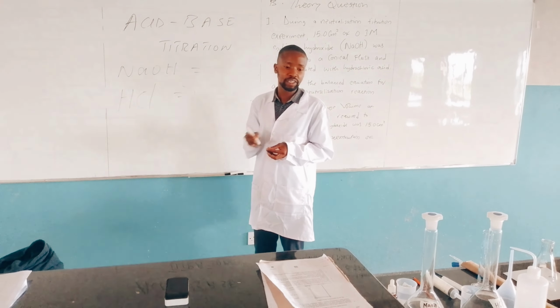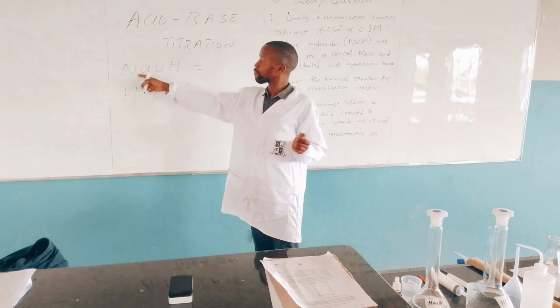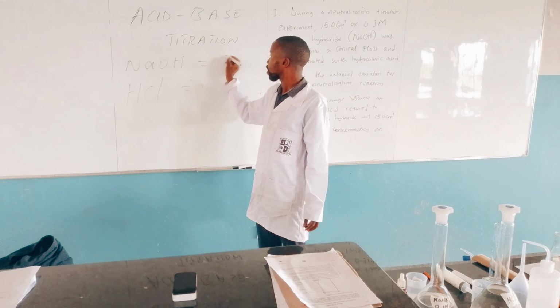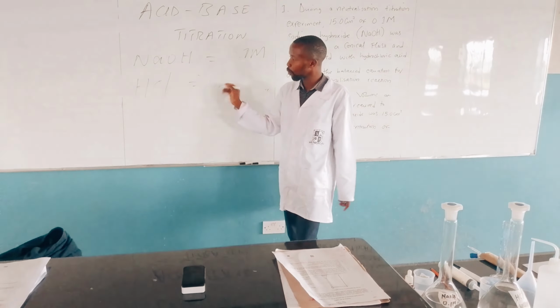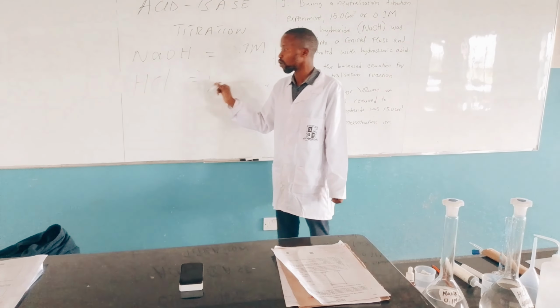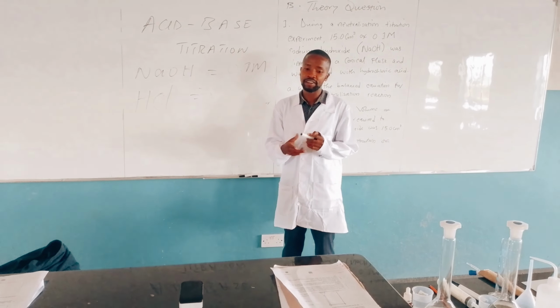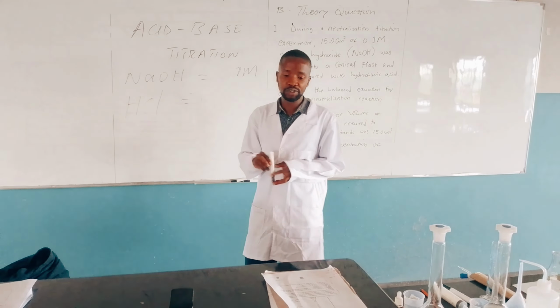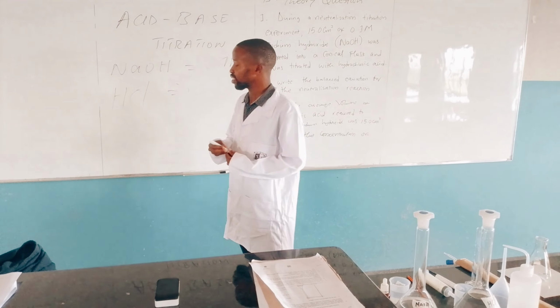But this time, the known concentration is for sodium hydroxide, 0.1 molar, and we want to find the concentration of HCl.